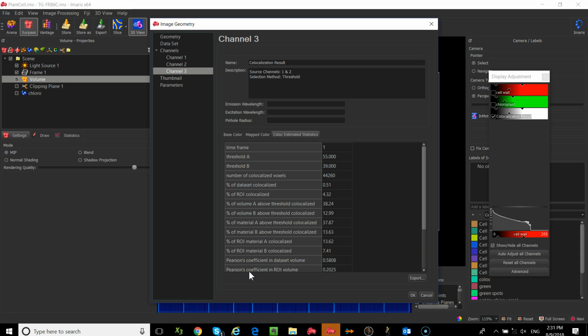Yes? I have a question, if you can do colocalization within a region, like say you use the cell function and you're interested in cells that have, say for single molecule FISH or something, transcript A and transcript B in one region, and then mask those out into ones that don't.